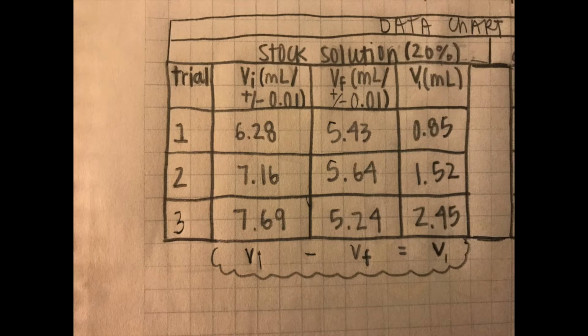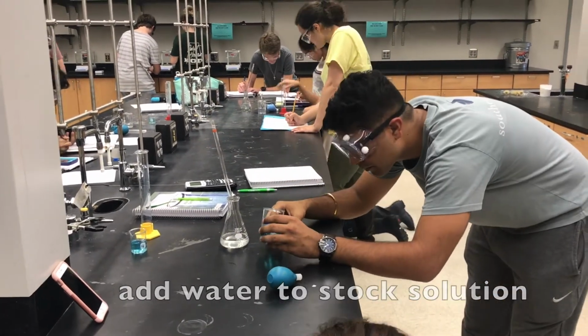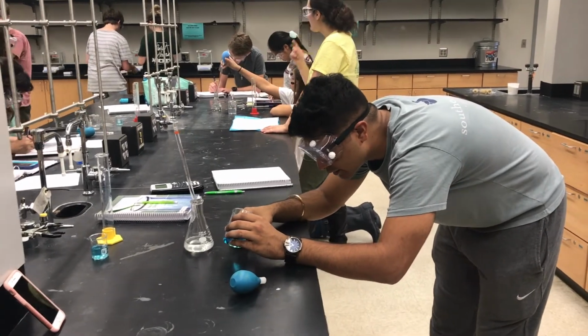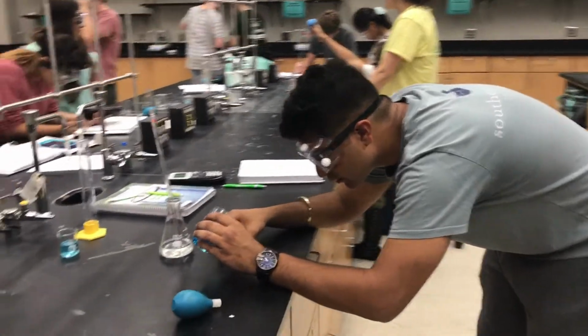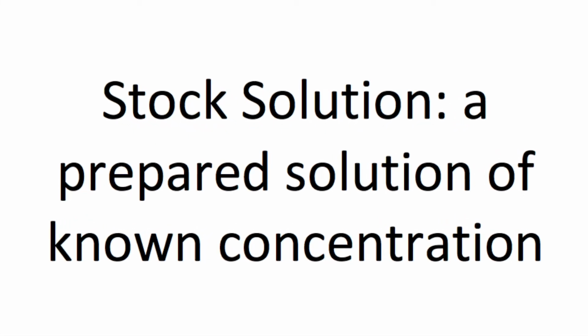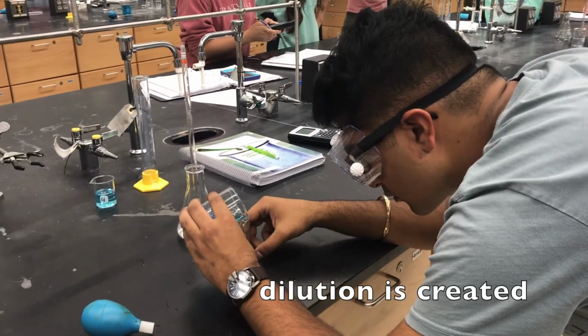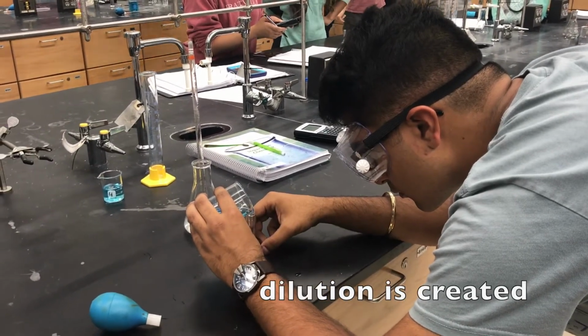After this, you can create a dilution by adding water with the transfer pipette to the volumetric flask until it reaches the measured line. So originally, you begin with a stock solution, a prepared solution which has an already known concentration. The dilution is formed from the stock solution by adding water to make it less concentrated.